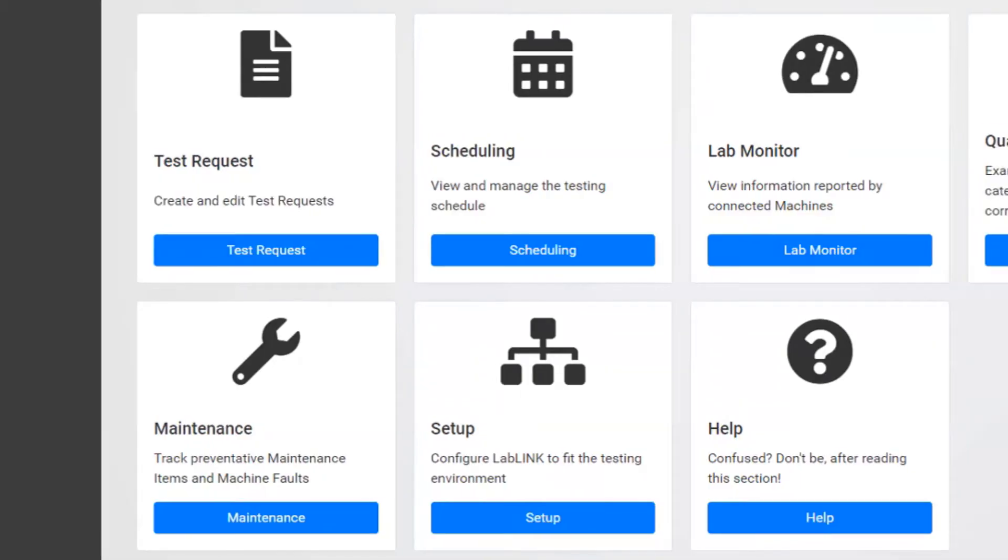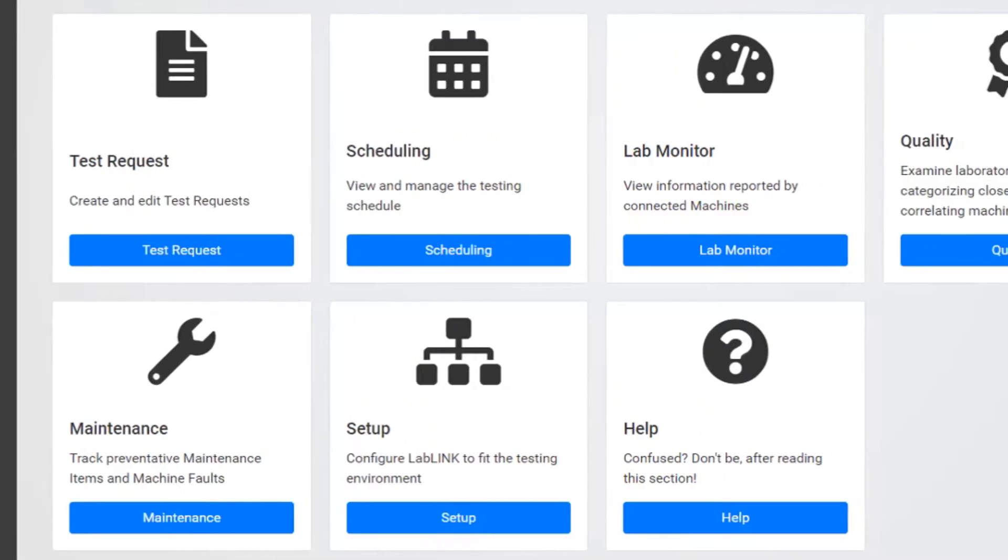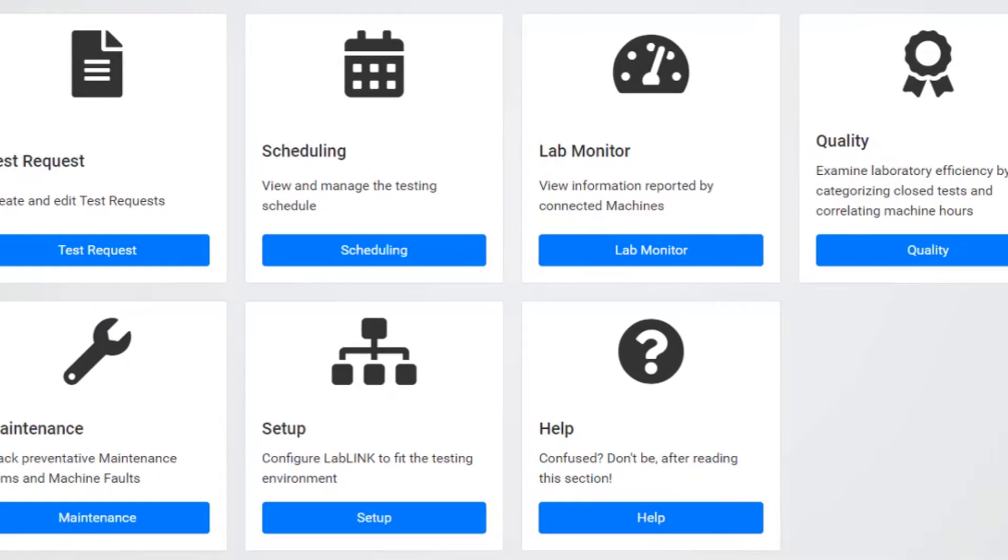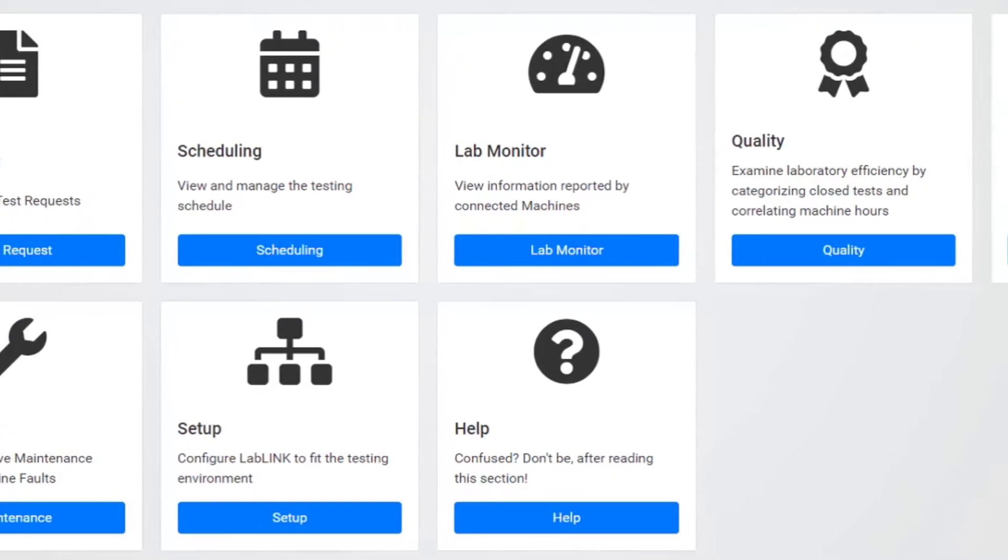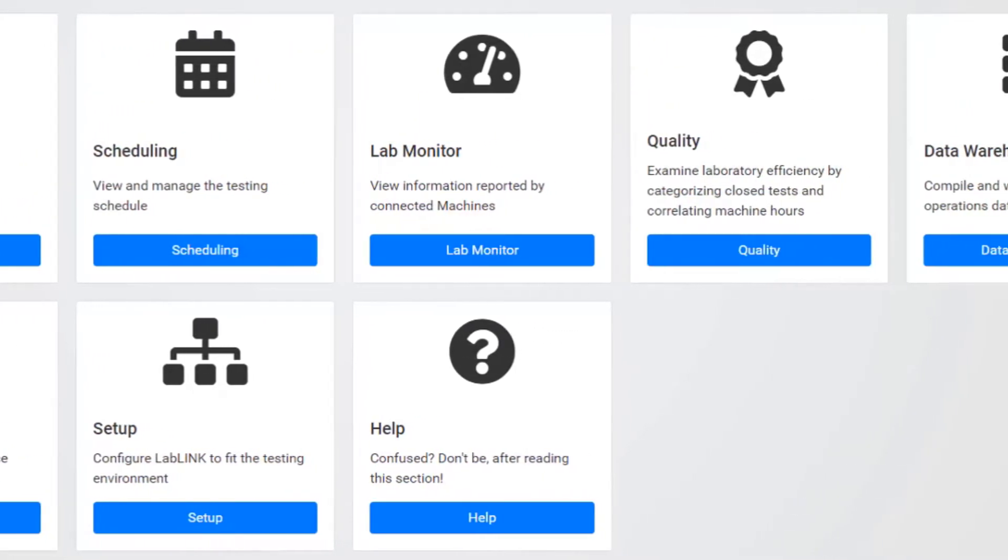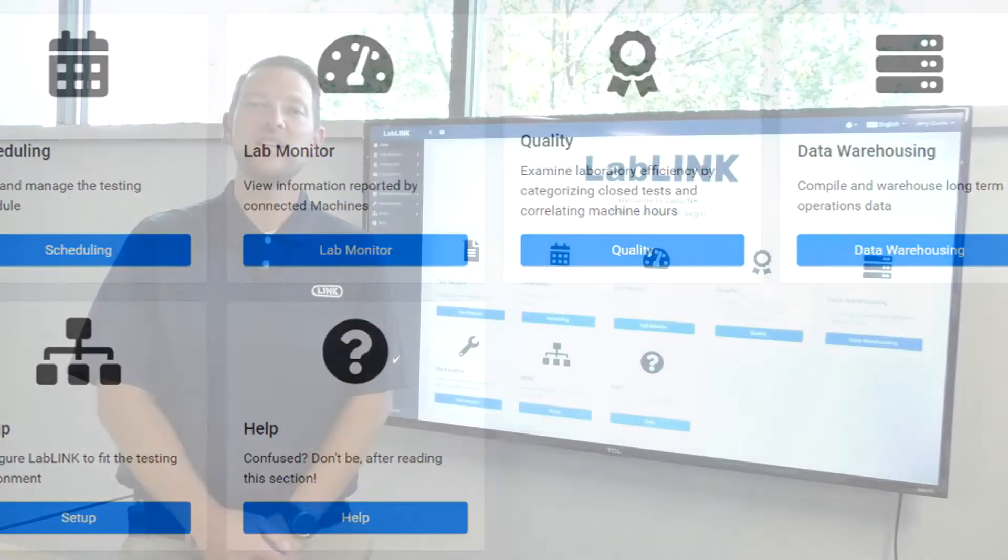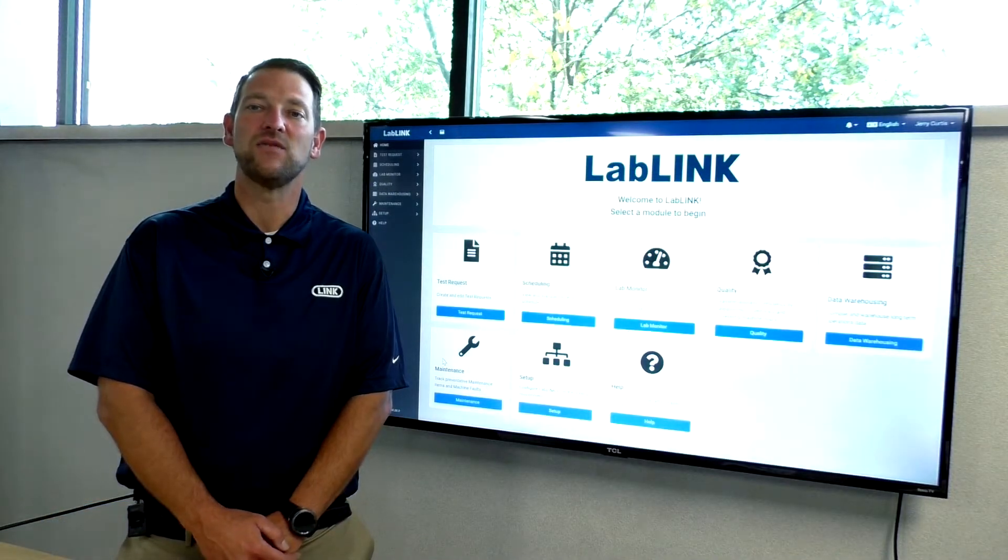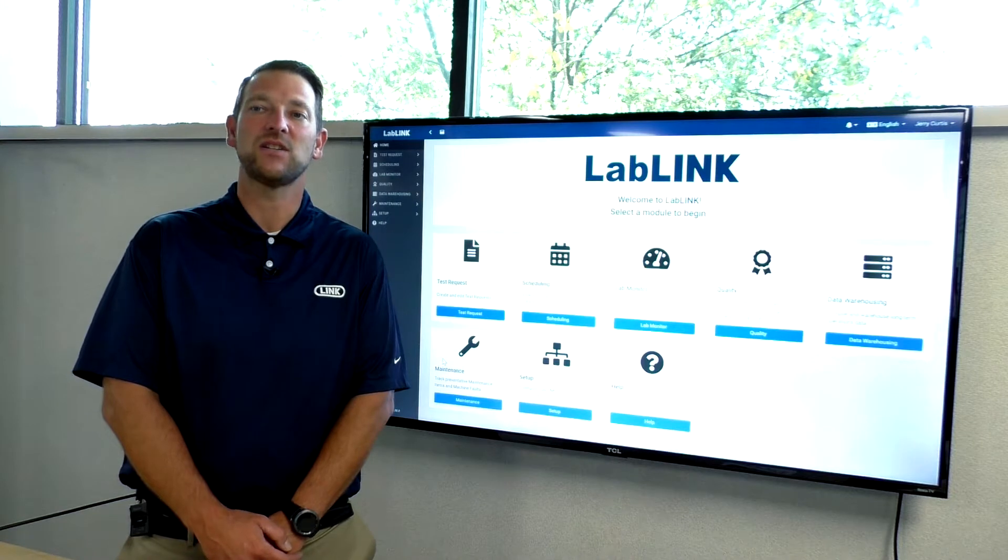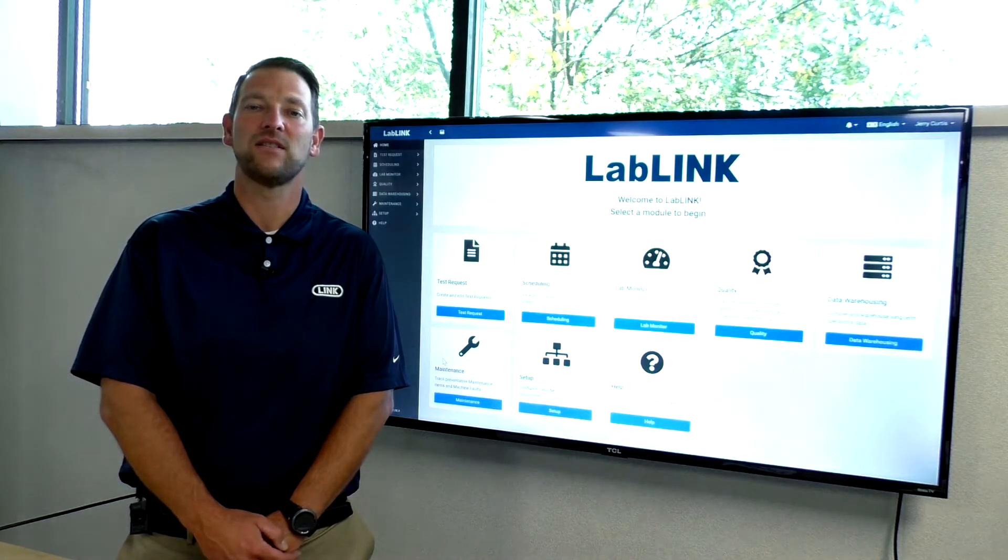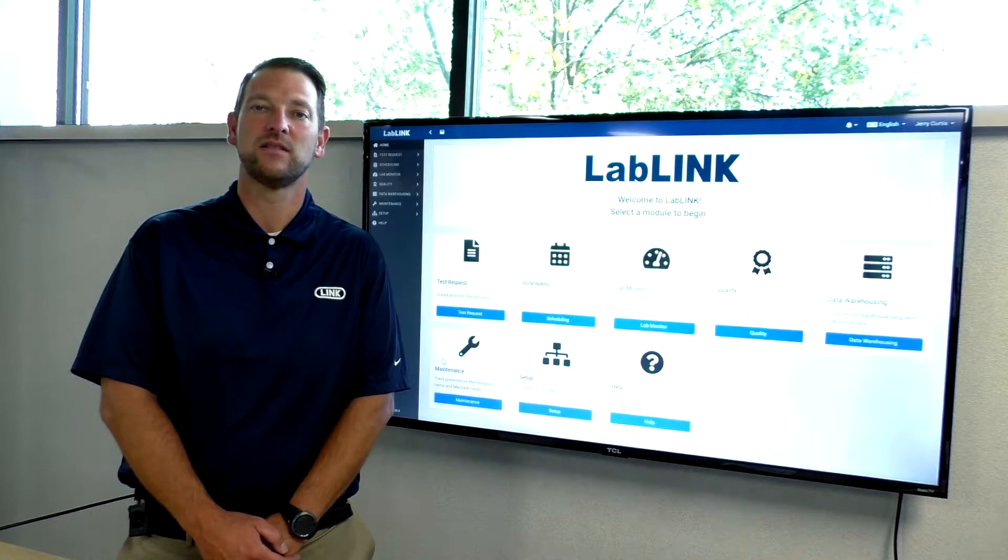All LabLink modules are interconnected and they are designed to seamlessly manage all phases of your testing process, from test request creation to test completion. Each individual module is designed to visually and intuitively execute the key need or task for that phase or process.